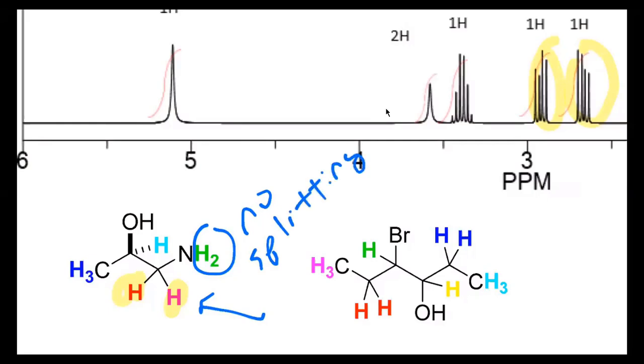Where are you getting 4 from? I only see 1. It's only 1. It's this hydrogen right here that it's going to split with, because it can't split with the NH2 that's on this side. Are you following? And then there's a carbon on this side of that carbon, and it only has 1 proton on it. Is that clear or no?